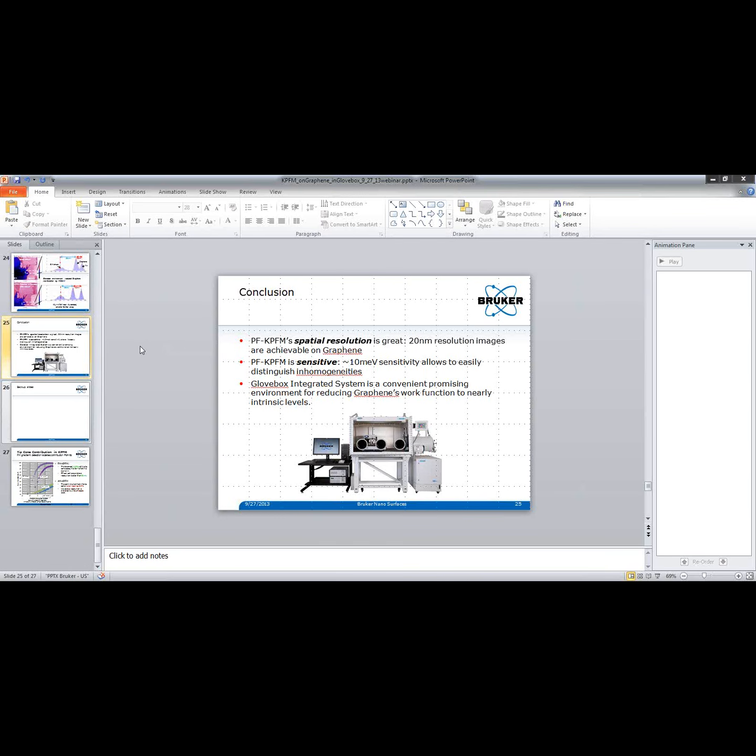But if you're talking about photoresist or something like that, it's also an organic material, and there's going to be charge transfer interaction between the graphene and the resist. Effectively, what you're doing is changing the number of charge carriers, electrons or holes, in the graphene by absorbing either polymers or oxygen or moisture.